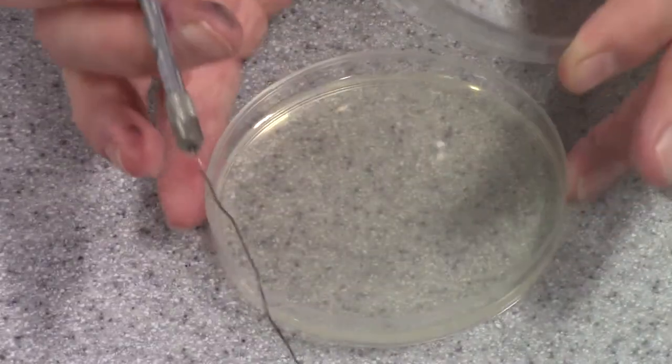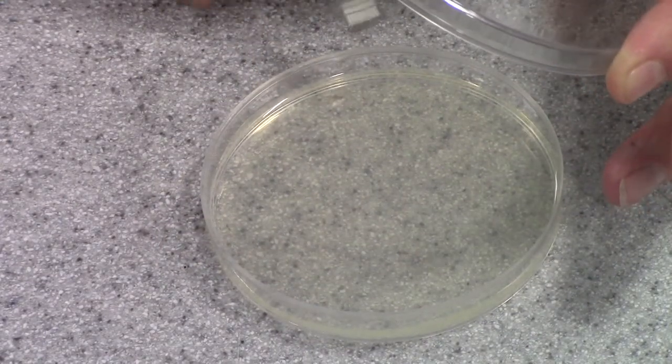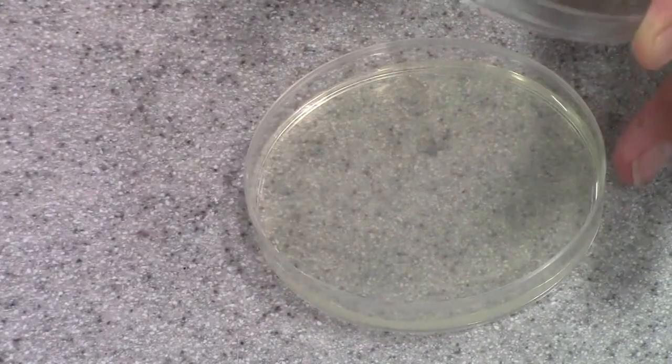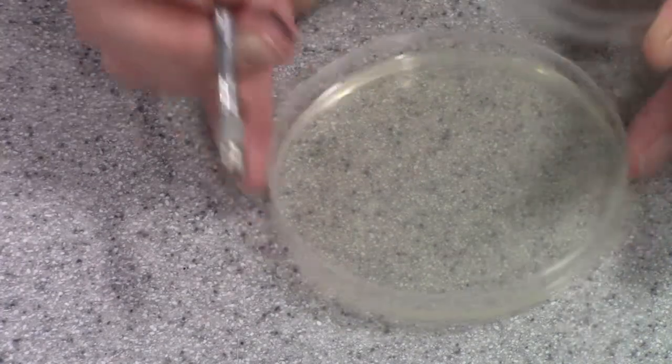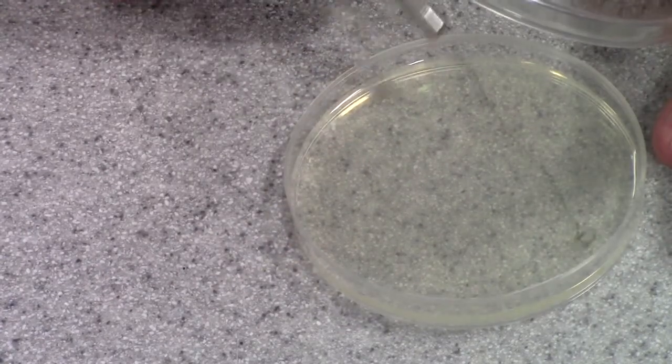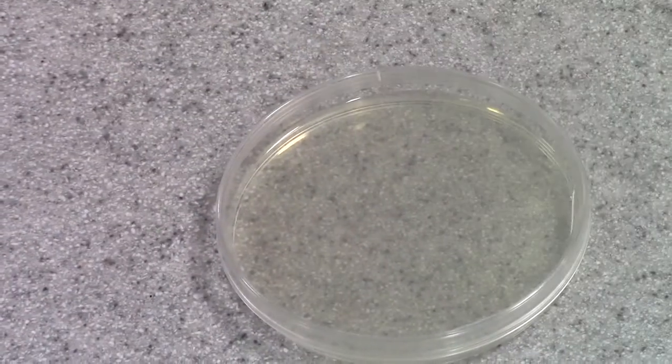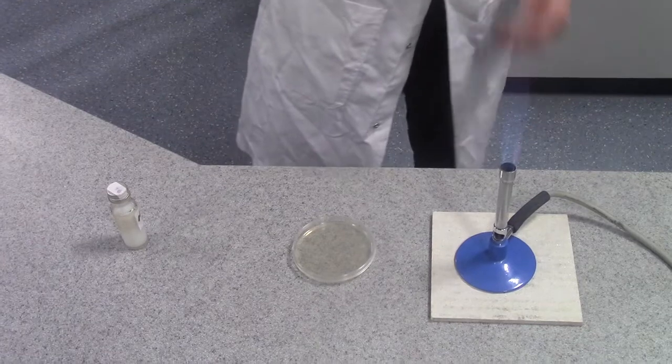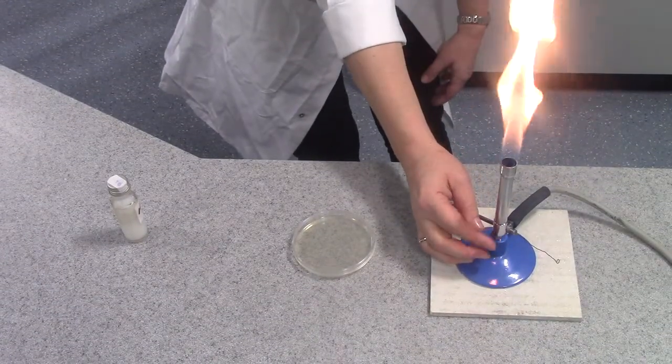You can then turn the dish to 45 degree angle and repeat the process. You'll then turn the dish again by 45 degrees, repeat the process, and then finally by 45 degrees, and just drag into the middle of the plate. Replace the lid, re-flame the wire loop, allow it to cool, and then put the Bunsen burner back on the safety flame.